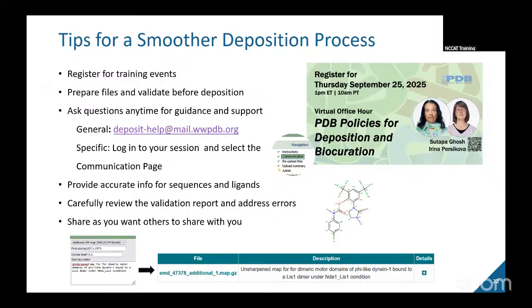Another thought in that regard. Has the PDB thought at all about how to deal with preprints? Yeah, there is a policy around that. I don't know if it's consistently applied by everyone, but they treat preprints as publications. So if there's a preprint, a biocurator won't release a structure unless its ID is very clearly in the paper. It would be nice to have the equivalent of a preprint for PDB.